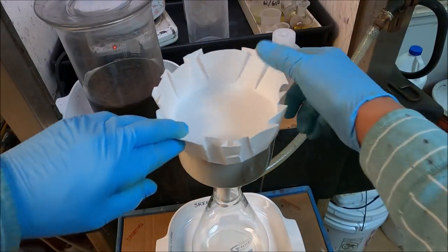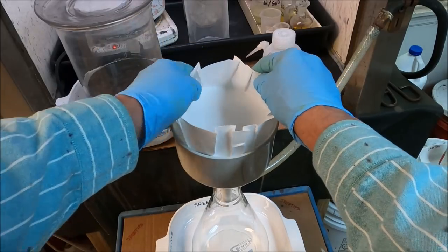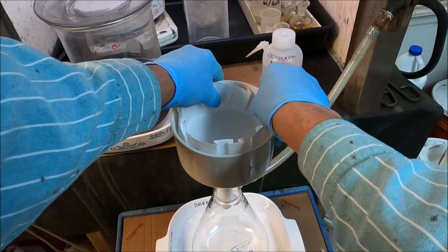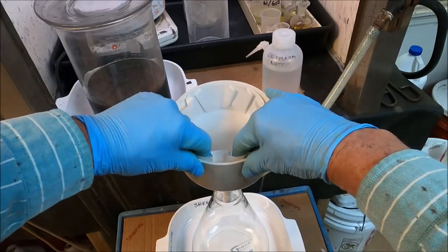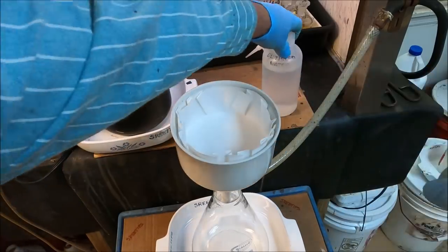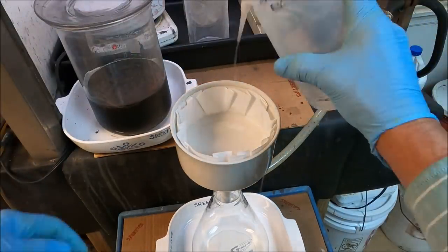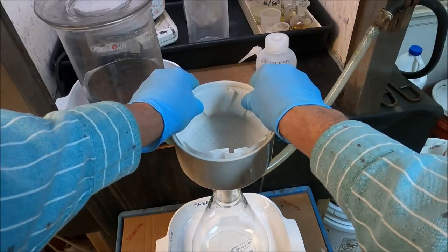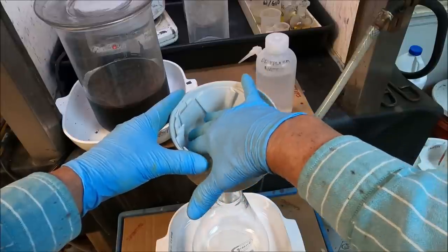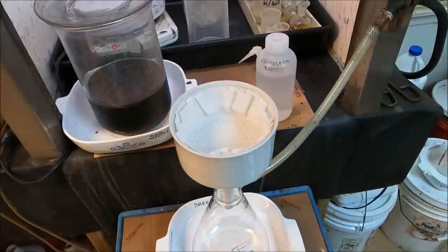I've got one of my specially prepared fitted filters here. Slip that down into this 12.5 centimeter Buchner funnel, and we're going to wet this thing, get a seal on it. Now I'm going to go over and light off my vacuum pump.